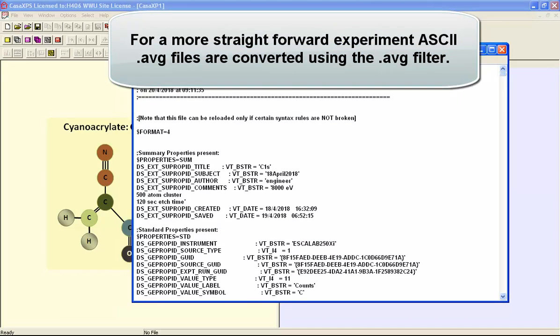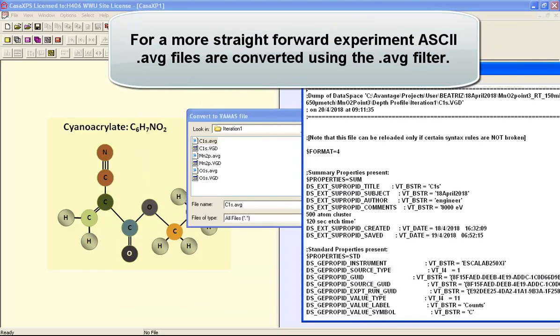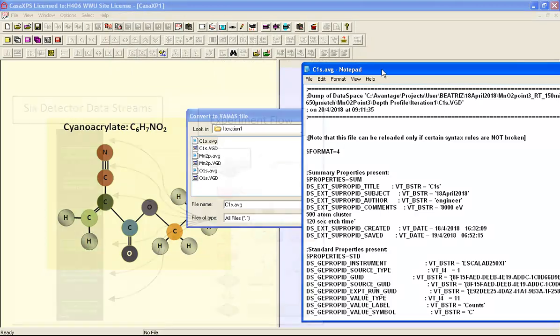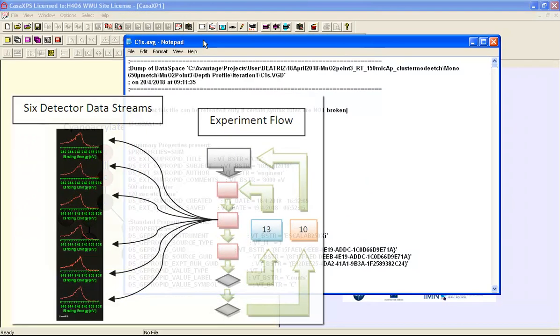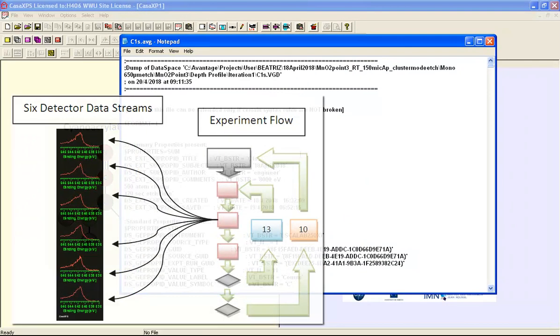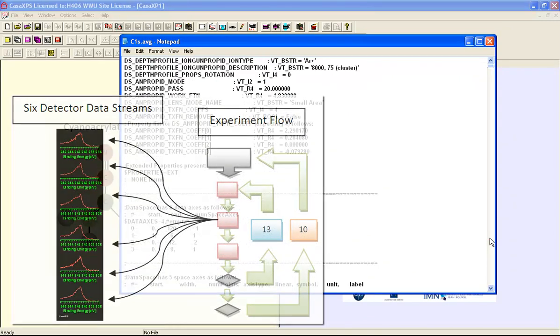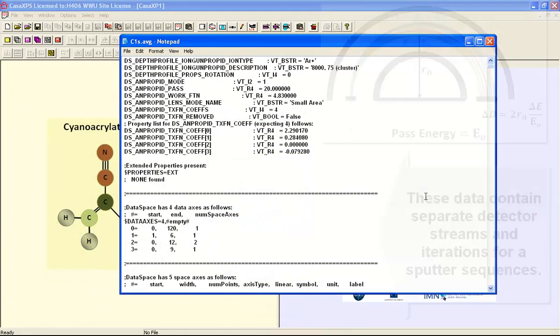So we have for each measurement, that is to say each narrow scan, we have an AVG file. And these files are in an equivalent format and this is the Carbon 1S that corresponds to the Manganese 2P and the Oxygen 1S.